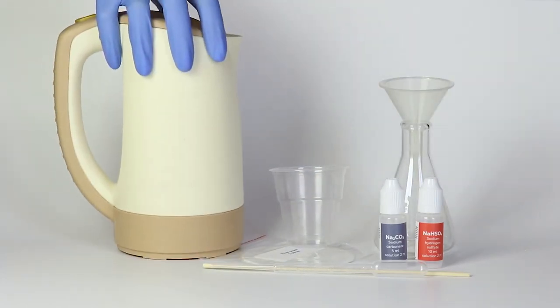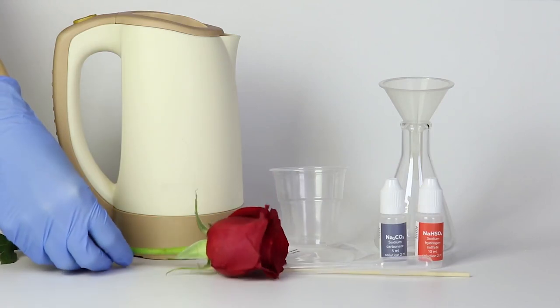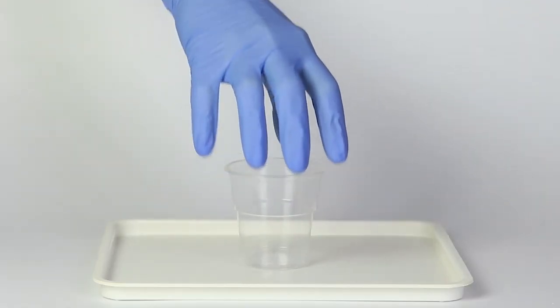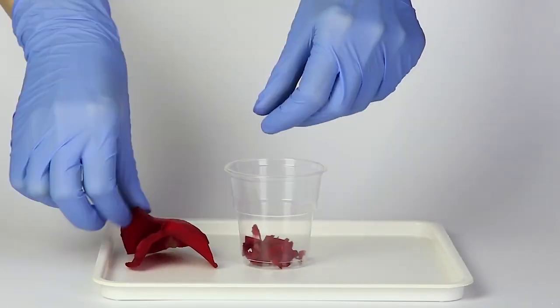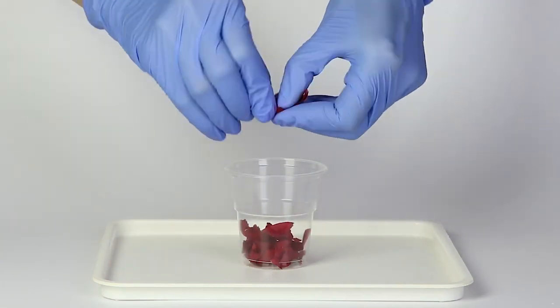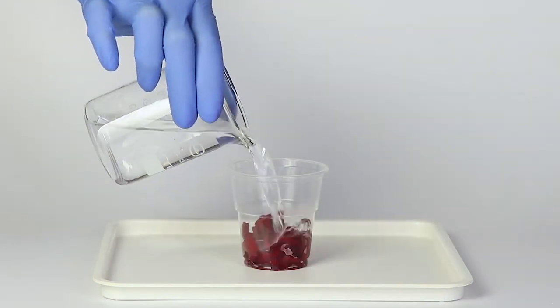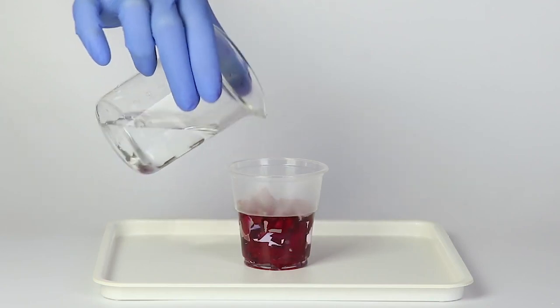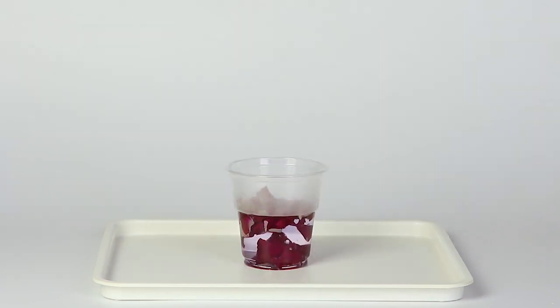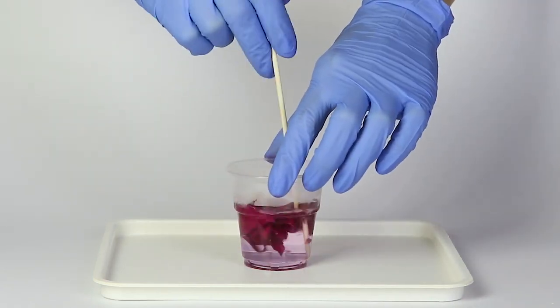Also, prepare some hot water and a red rose. Tear up some petals and put them in the disposable cup. Add enough hot water to completely immerse the petals and stir the mixture with a wooden stick.